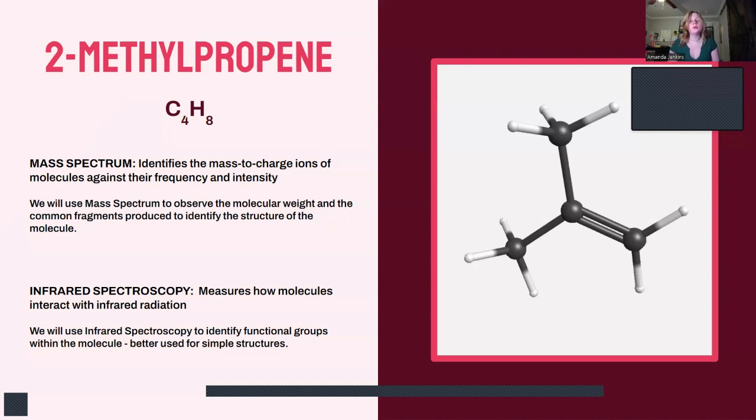It has a molecular formula of C4H8. We'll be using mass spectrum and infrared spectroscopy to get a better understanding of how we use these tools in order to identify unknown compounds that need identifying.